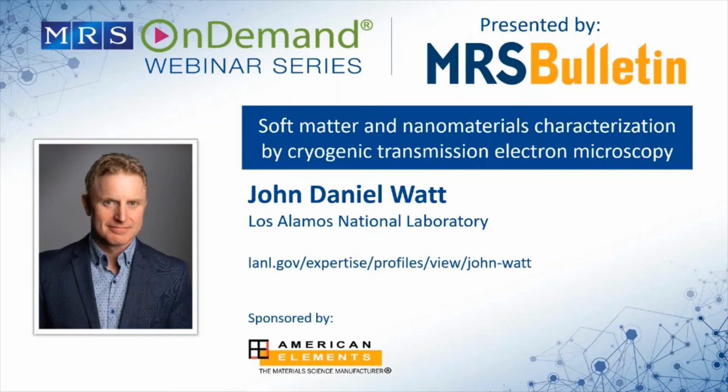Yeah, so this is an interesting question because I think a lot of the time in materials, especially nanoparticles, we have a finite size and shape distribution, and that's one of the things we're always trying to do, is tighten that up. So for these single particle reconstruction techniques to be applied to soft materials or nanomaterials, we need a very high quality ensemble with a tight size and shape distribution. So experimentally, this is quite difficult to achieve, even with the highest quality biomimetic materials.